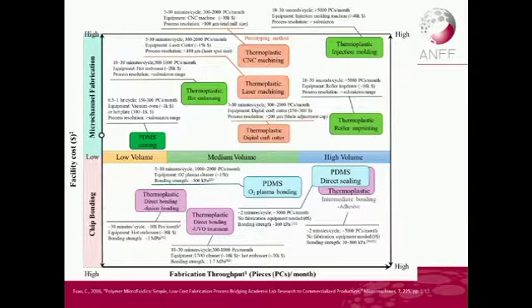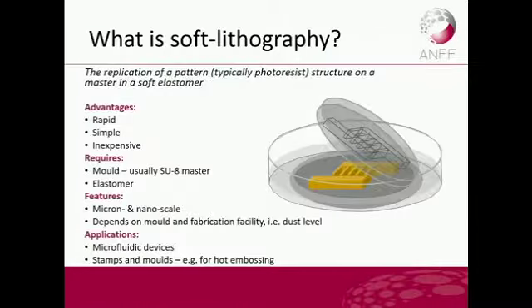This one, I thought it's nice to put in there in terms of the volume output and where PDMS lies. PDMS is mostly only used at the research level, but if you want industry level bulk fabrication, then you probably want to go more like thermal injection molding and so forth. So this is just to see where PDMS lies.